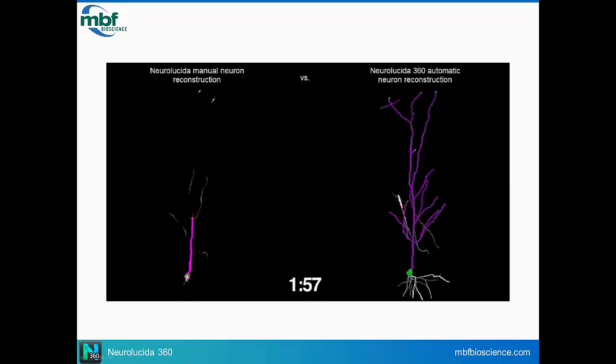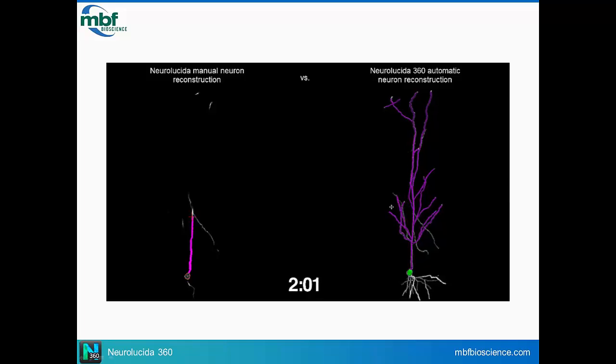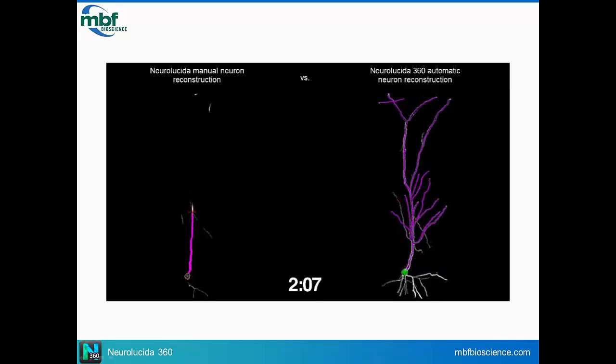There's just an extraordinary amount of analyses that you can pull out from your data that you can go back to and enrich time after time after time. So if you've got one of those large montages of your neuron, you can analyze it in bits and parts and keep coming back to it and mining it for more and more information.